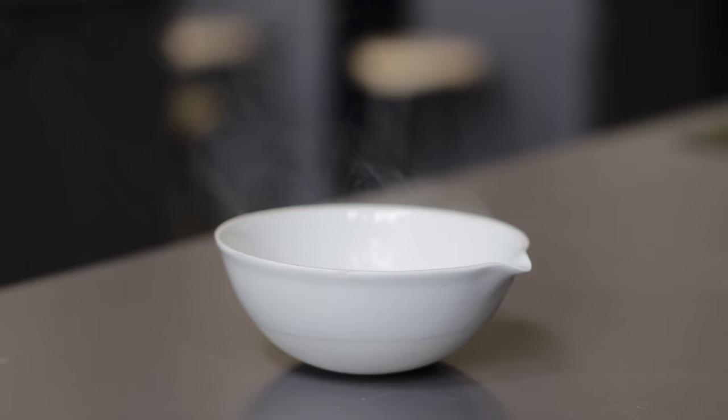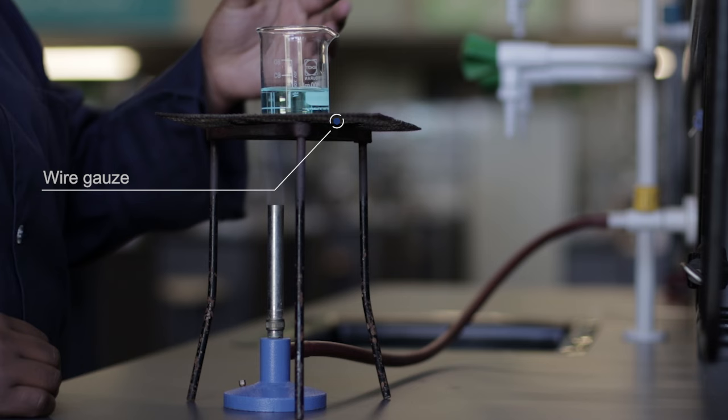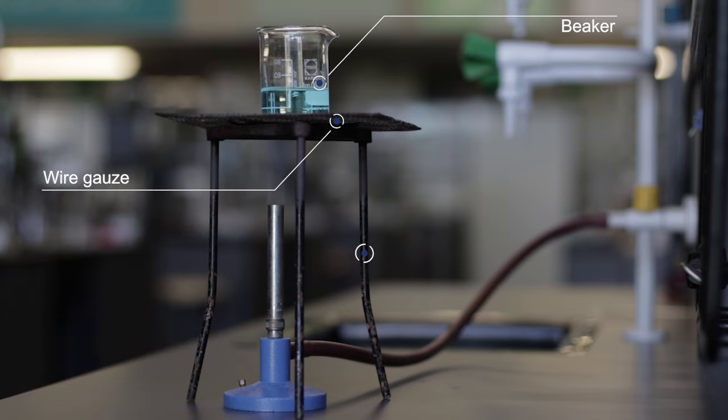The evaporation dish is used for the evaporation of a solution. Wire gauze is placed between the beaker and the tripod to support the beaker while heating the solution with a Bunsen burner.